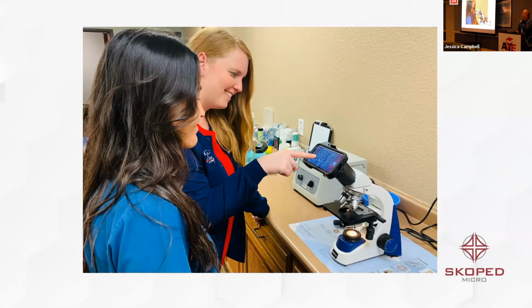Dr. McCullough is showing one of our other coworkers something. I can't remember what it was. It probably was nothing, but it's just that easy, because now we can walk up and go, there it is right there. It's not the back and forth on the eyepiece. It's not the I wonder, whether I'm teaching a client or a technician or anybody. That's most of my day anymore.